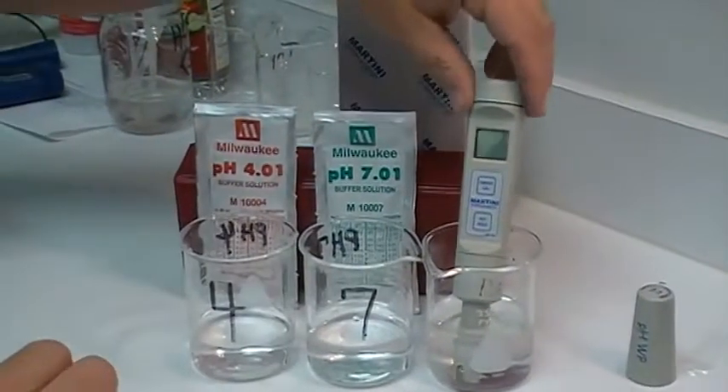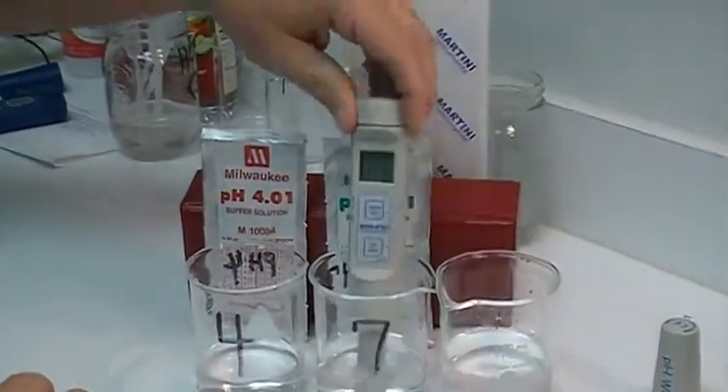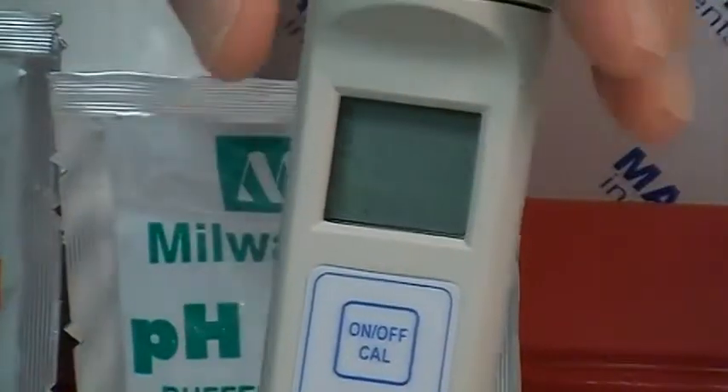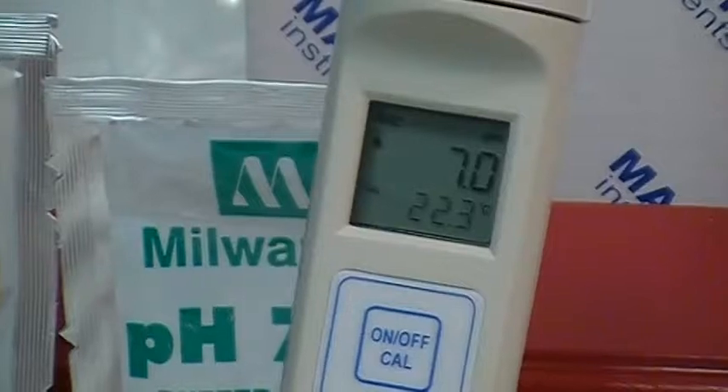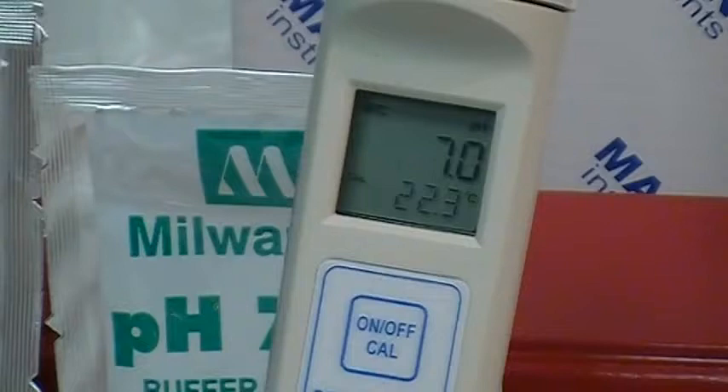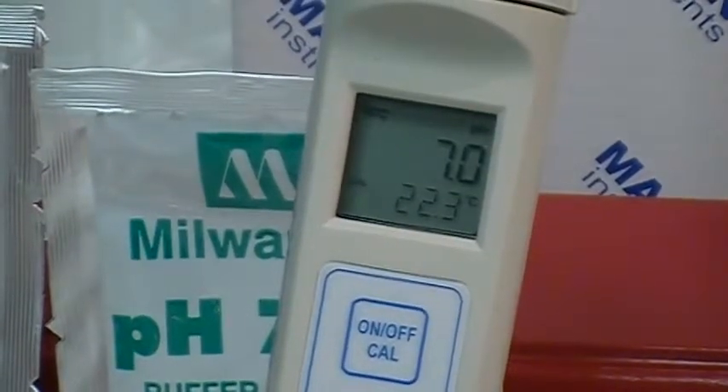We're going to move it — with it still off — over to the 7 calibration solution and turn the unit on. At this point you'll see it come up; many times right out of the box it comes up fully calibrated, so that's not necessarily unusual.